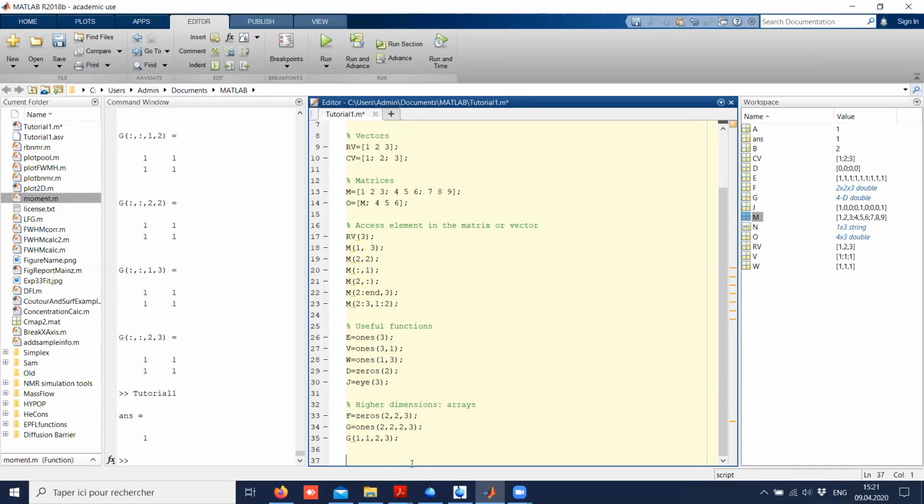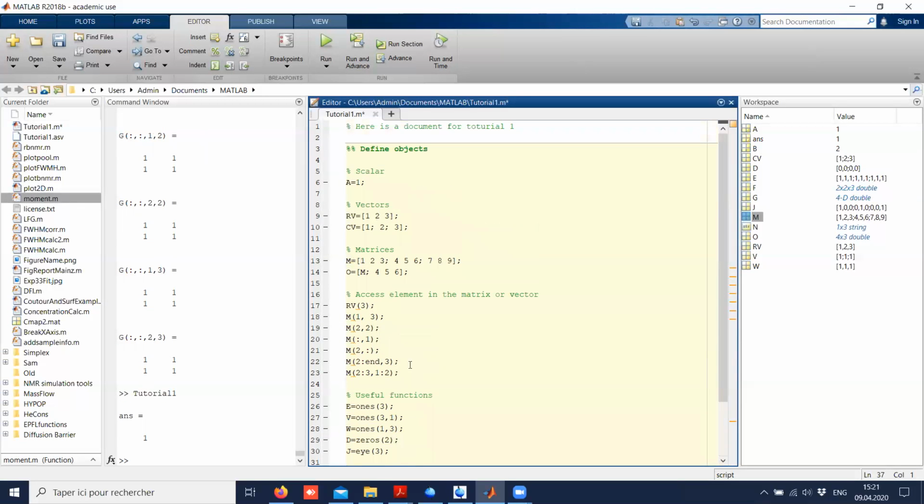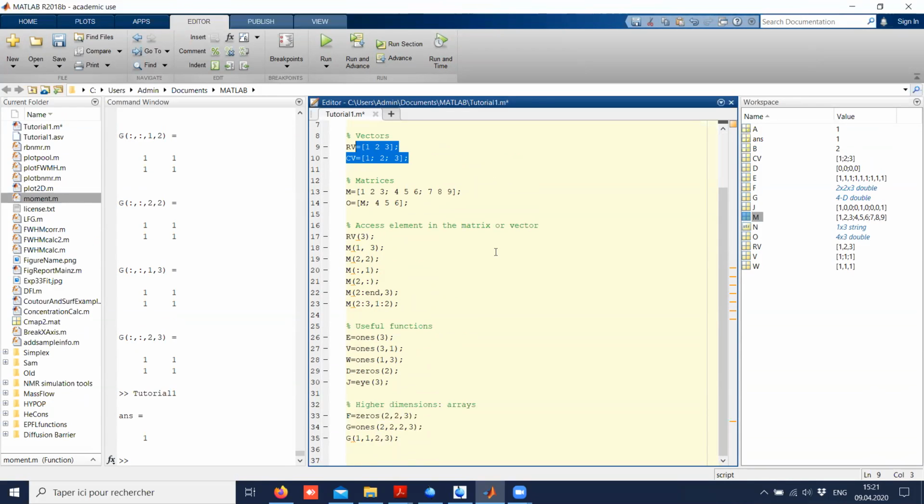I just have a quick question. From what I recall from my mathematical classes, matrices can be of higher dimension, tensors. Do you call array just the matrices that are of dimension higher than 2? Yes. I usually say scalar, vectors, matrices, and arrays. But a scalar is a 1x1 matrix, a vector is n by 1, and so array is a very general concept.